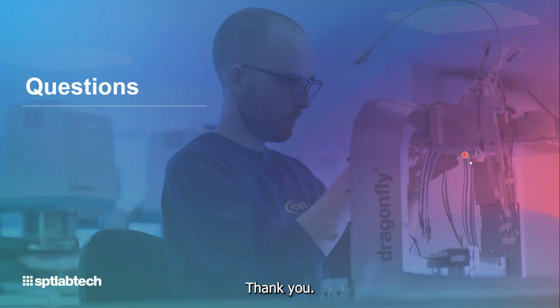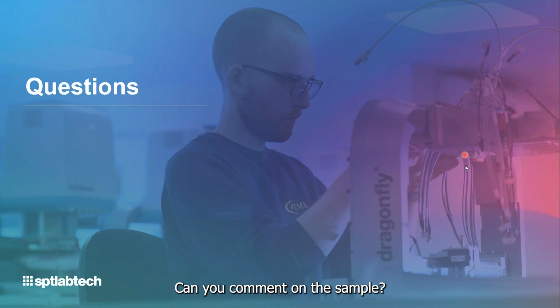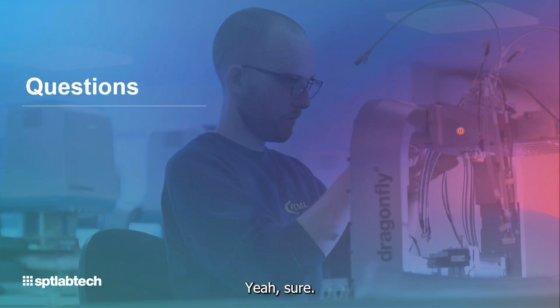Sounds great. Thank you. Next question, perhaps this one is for you, Anita. Can you comment on the sample variation you would see across a 96 well plate? Yeah, sure. So sample variation can originate in different ways. You can get sample variation if you've got inaccuracies in your pipetting and dispensing. I don't believe we have issues there with Firefly.